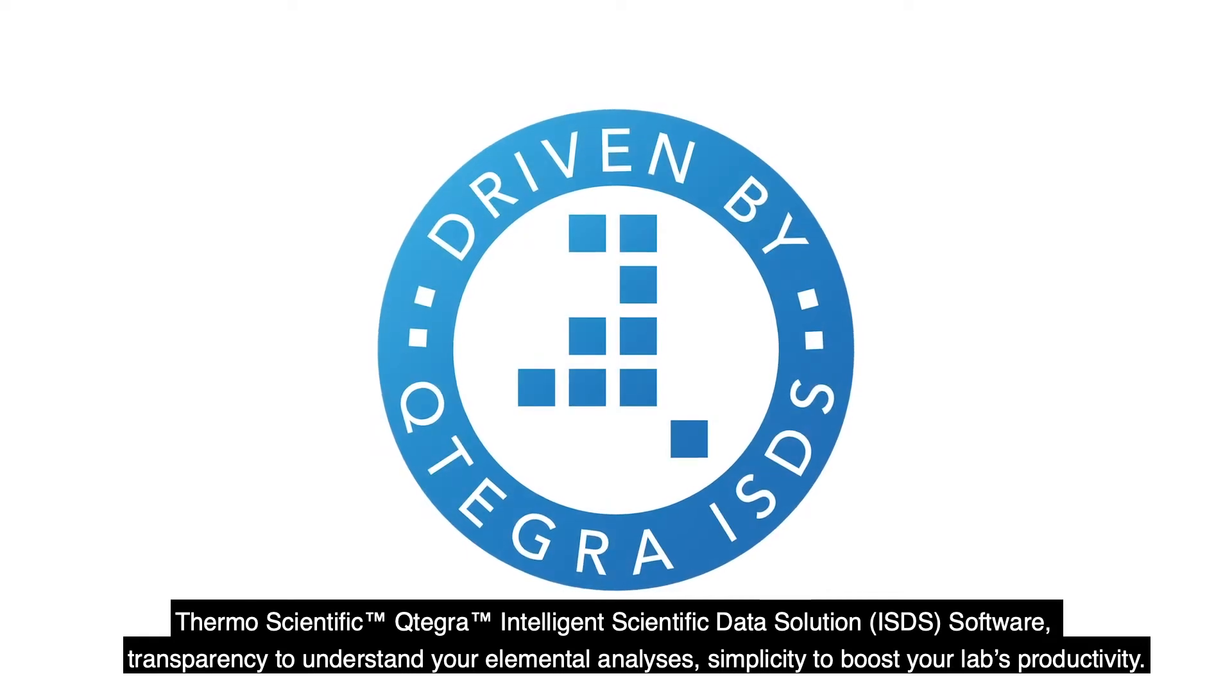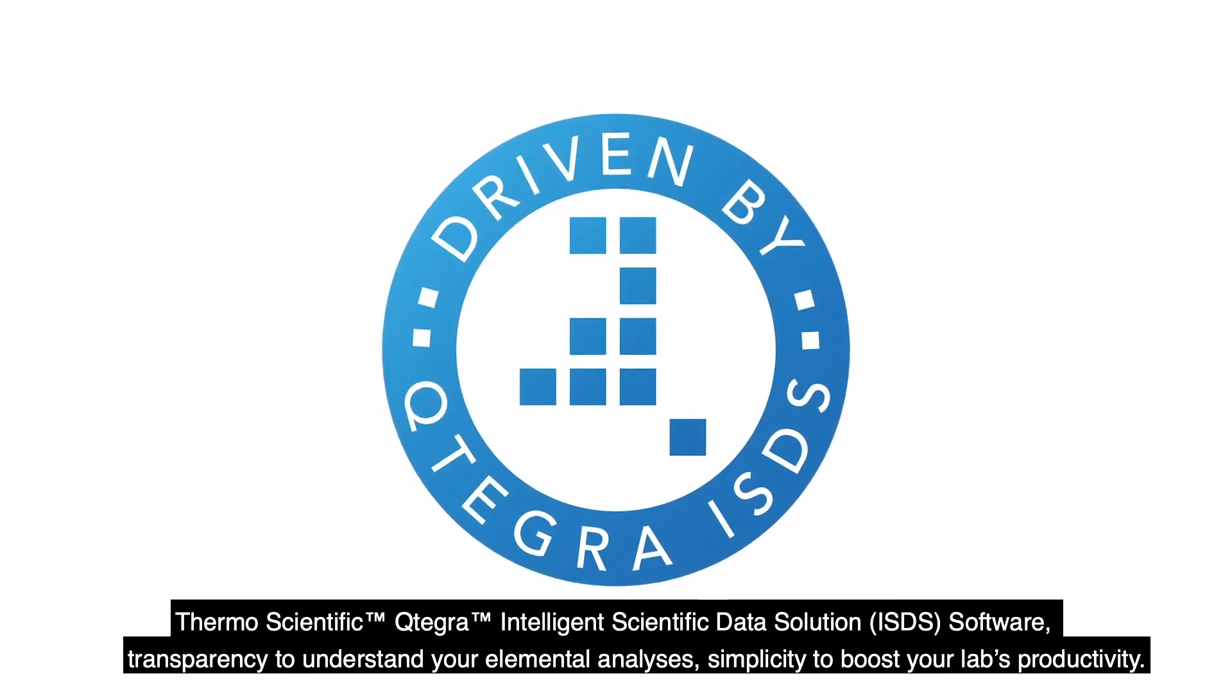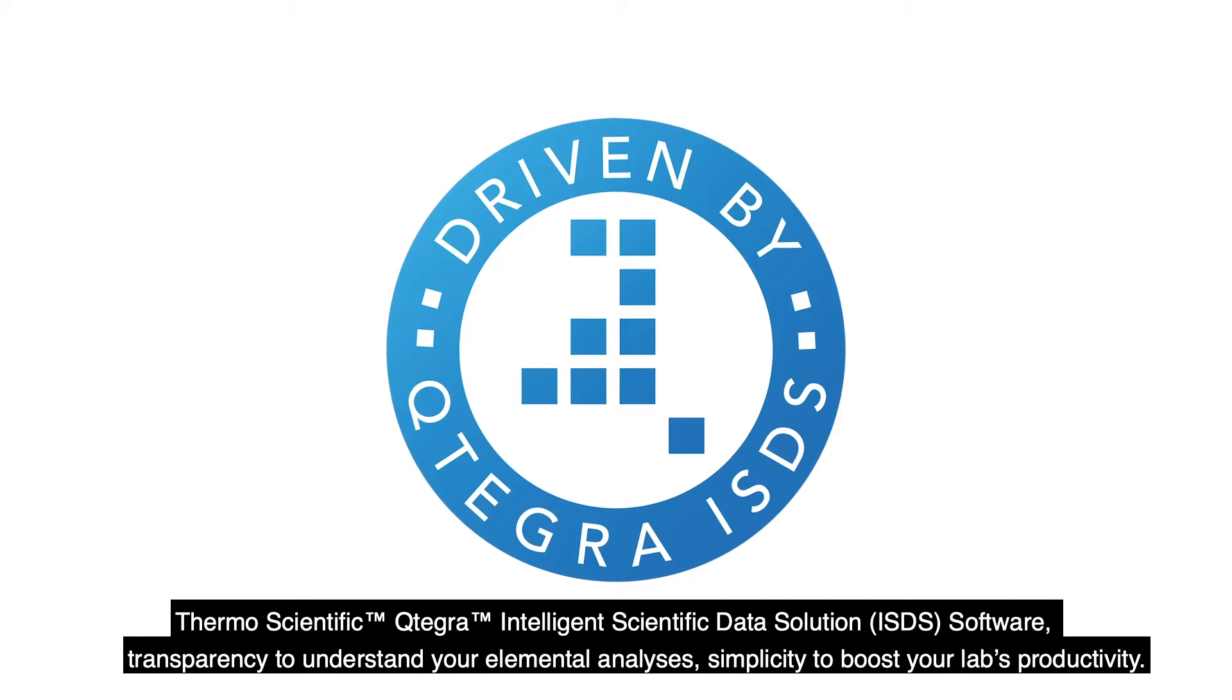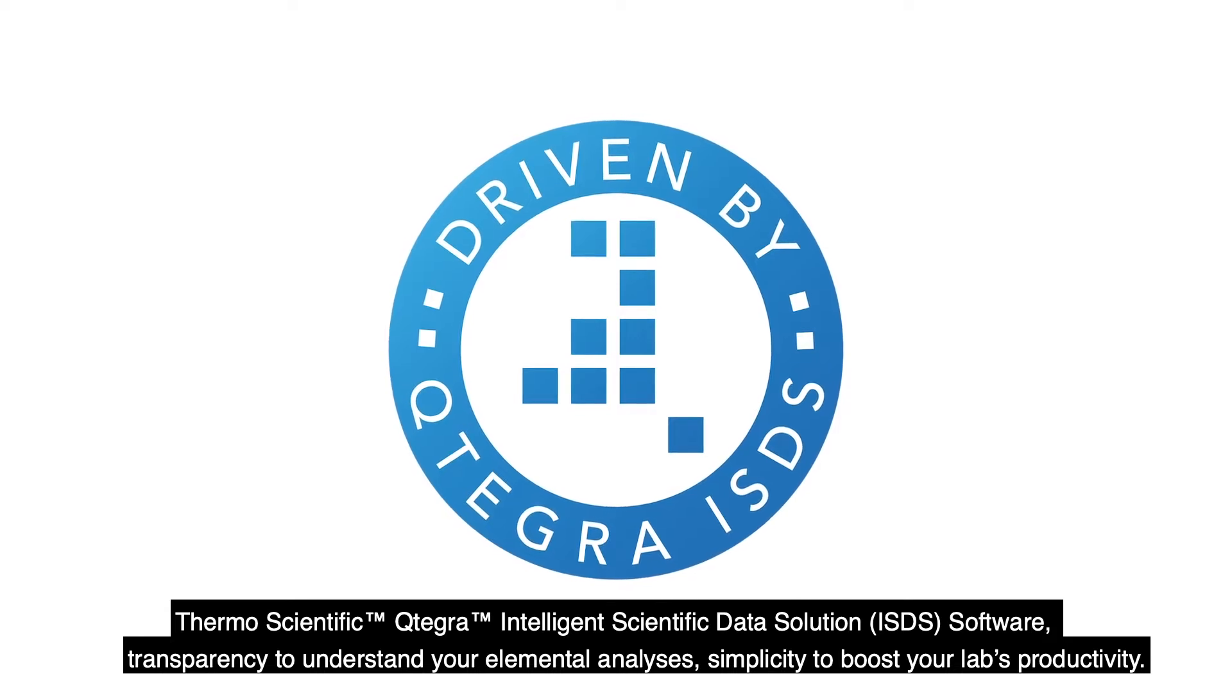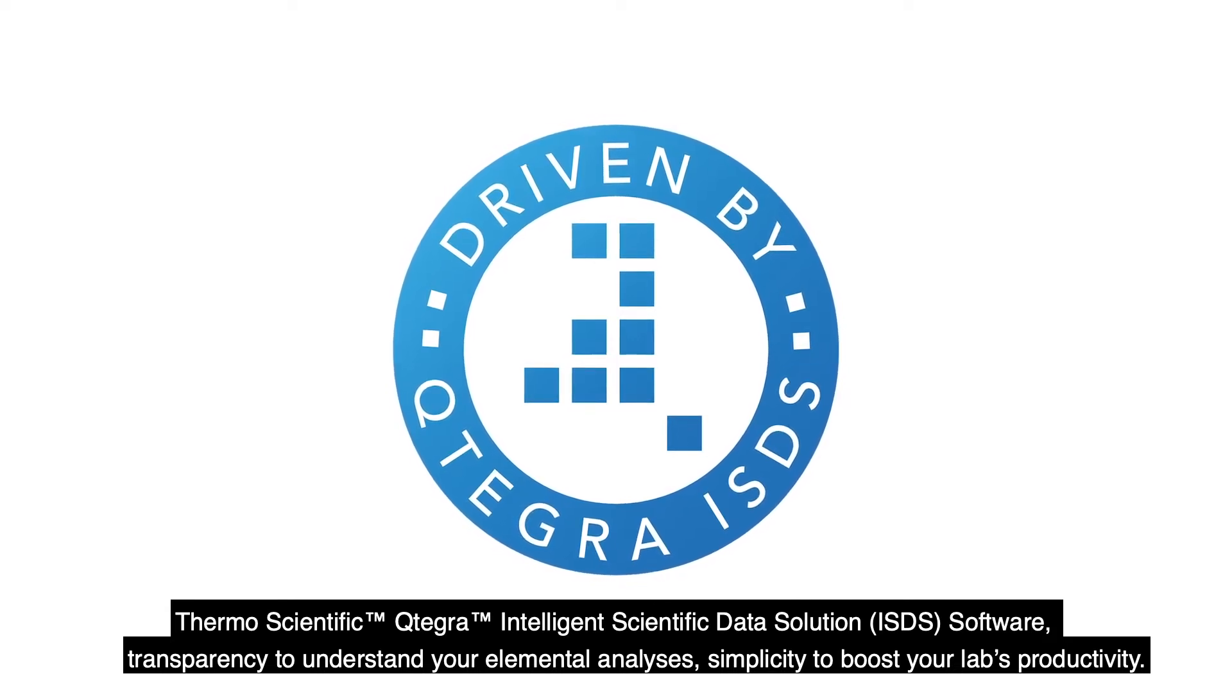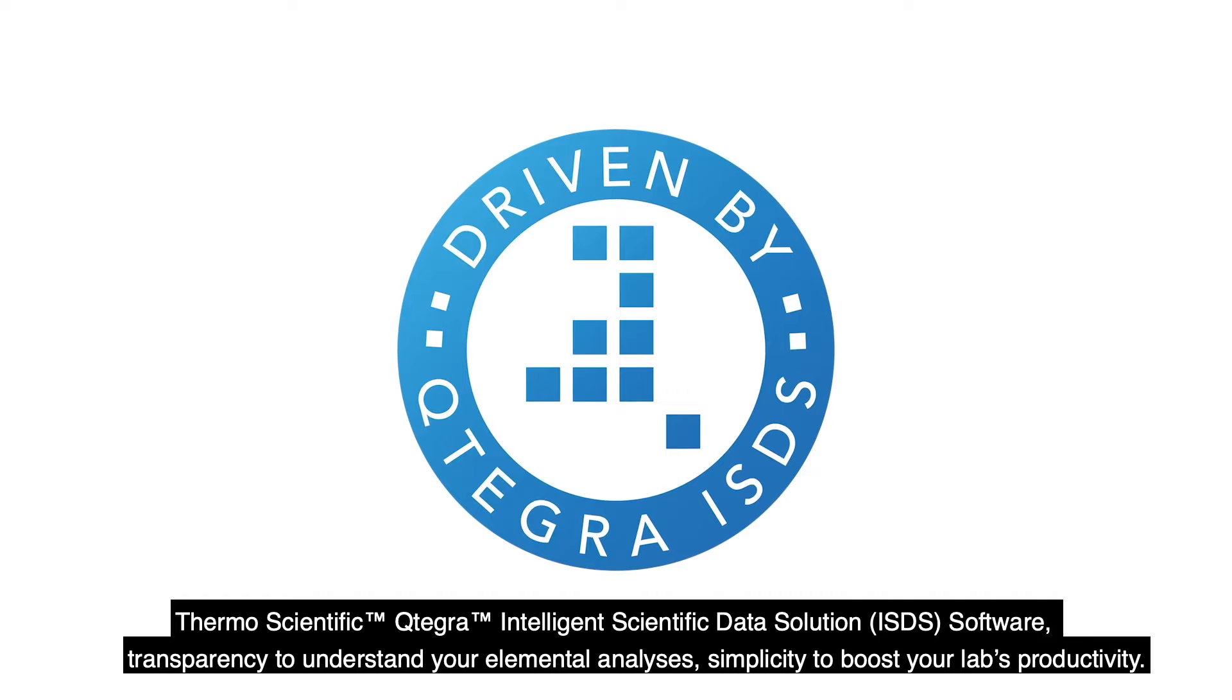ThermoScientific Qtegra Intelligent Scientific Data Solution Software. Transparency to understand your elemental analysis, simplicity to boost your lab's productivity.